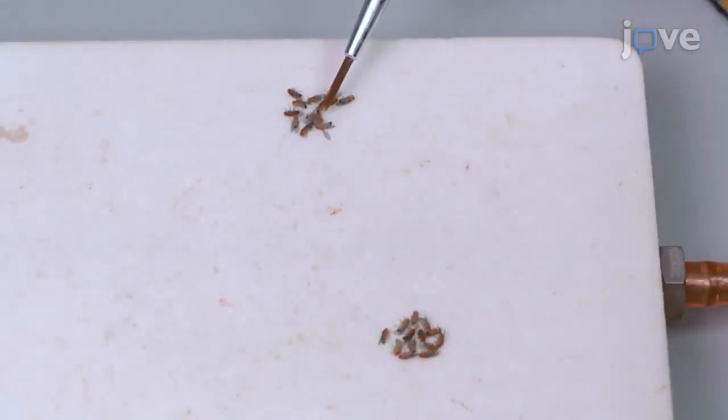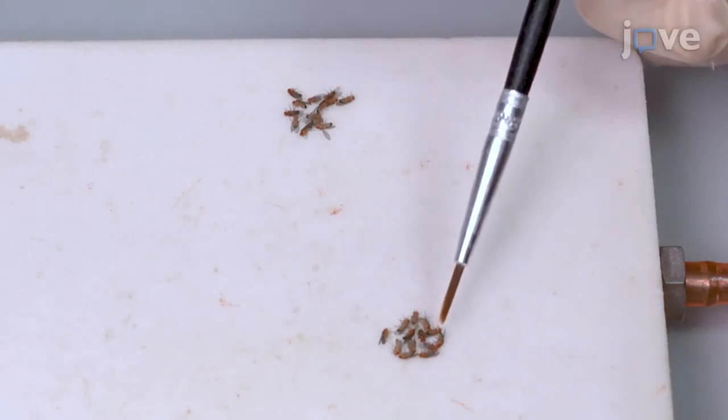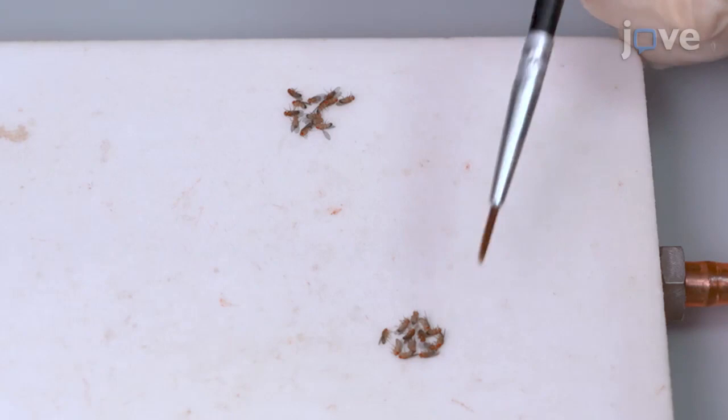One group will serve as the control uninjured flies, and the second experimental group will be subjected to penetrating traumatic brain injury.